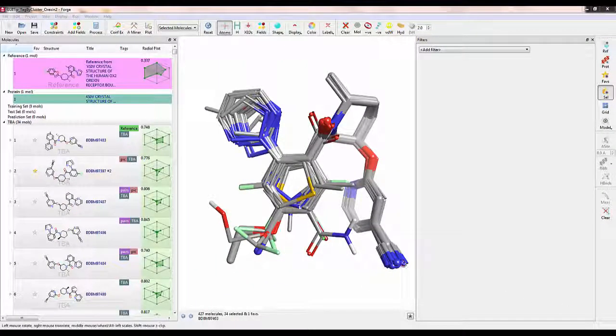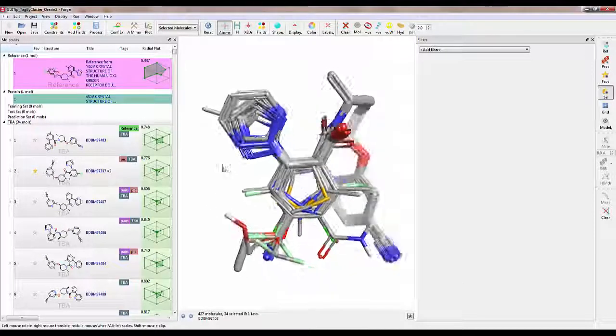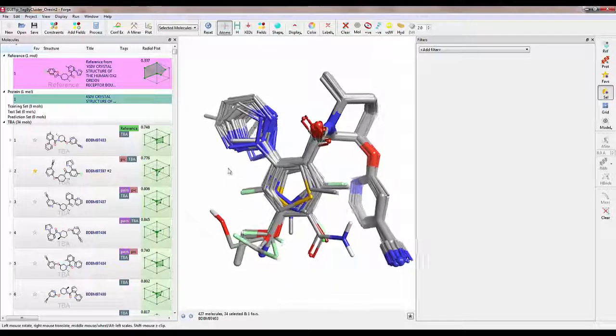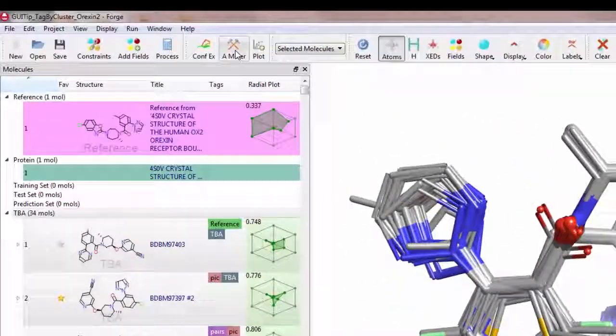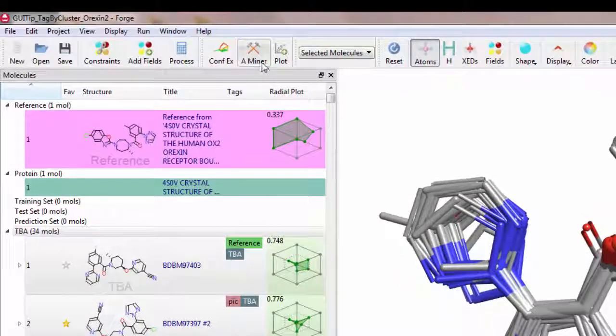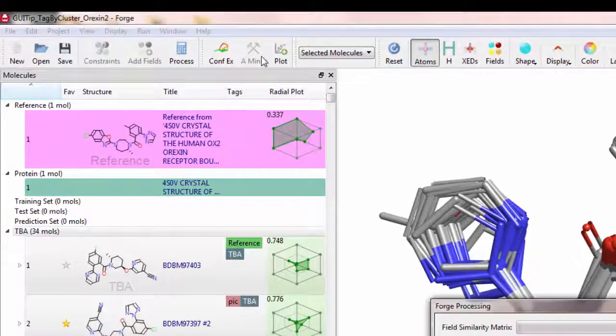In FORGE, I have an aligned set of orexin-2 inhibitors. I will run ActivityMiner on this set by pressing the ActivityMiner button.